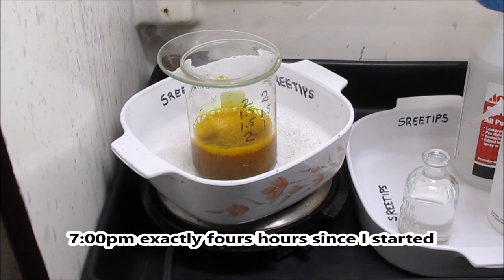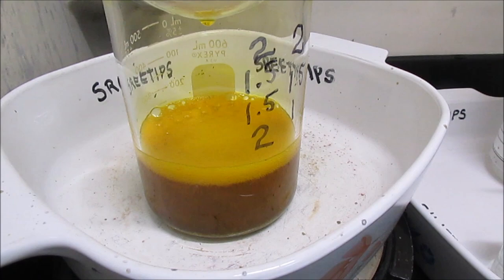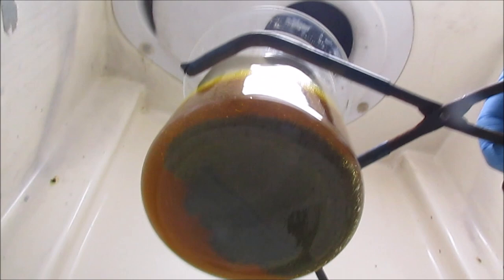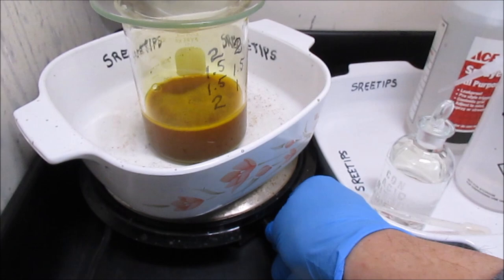Temp in there is 226 degrees. I added about 5 drops of nitric acid to this hot solution, and it fizzed up pretty good, but I don't see a whole bunch of fumes in there. There's still a bunch of stuff on the bottom there, but I don't know what that is. I'm gonna go ahead and turn the heat off, let this cool down. I'm gonna filter it out and we'll see what we get out of that solution.